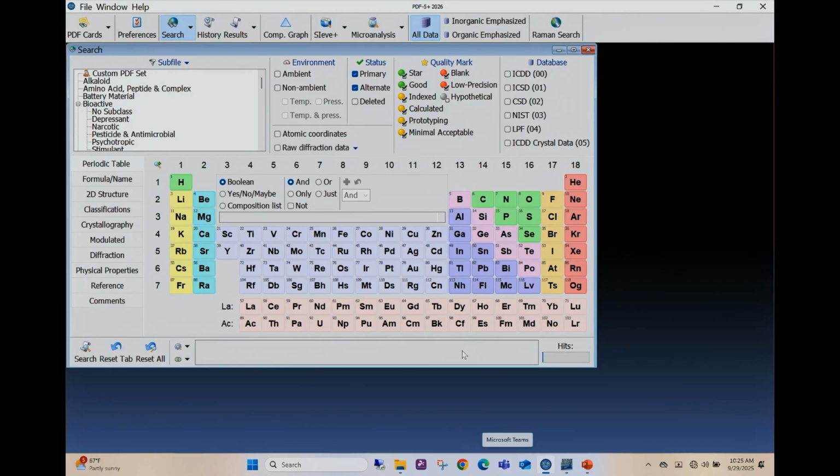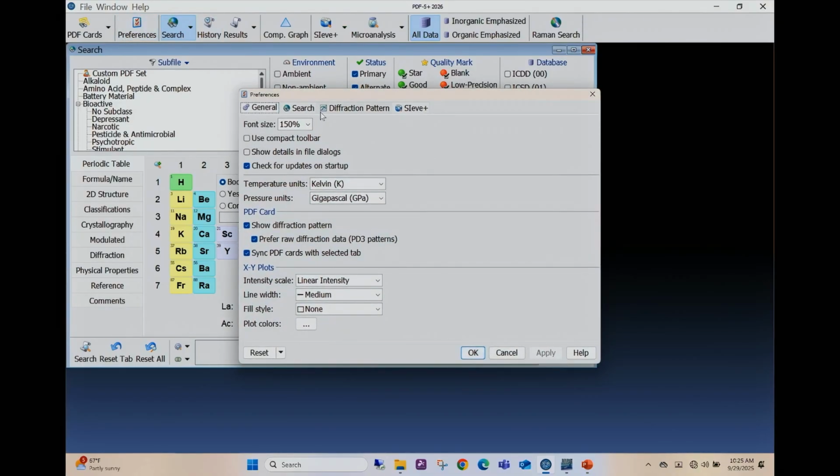let's take a look at something here. One of the things that is helpful, particularly for people who need readers to see something, you have a preferences icon here, and with that preferences icon, you can adjust the font size. So the default is 100, you can go up to 175, so it just blows the image up. And obviously, if you had a large monitor, it's really nice when you can blow up the text and the font and everything, so you don't have to squint and try to see what's going on. The laptop, maybe not quite as convenient, okay?